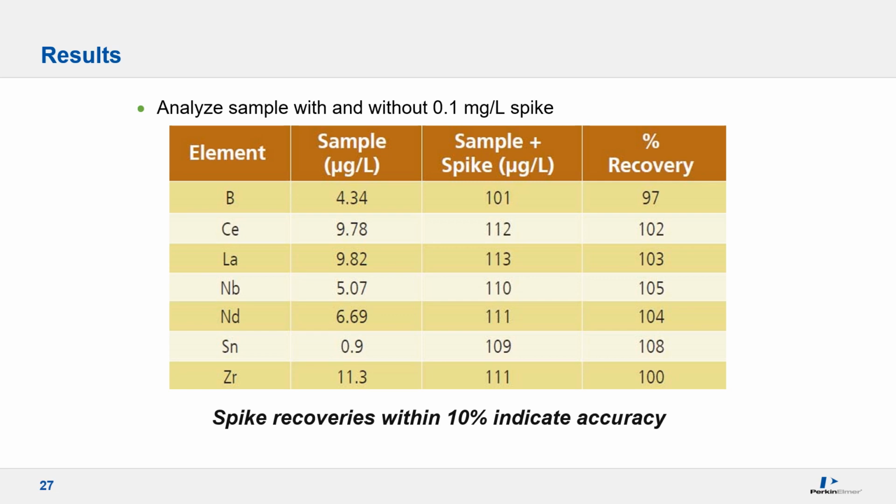The work demonstrated by this application has shown the ability of PerkinElmer's Avio 500 ICP-OES to resolve challenging interferences in a metallurgical sample using multi-component spectral fitting. Taking advantage of MSF allows samples to be analyzed in normal resolution mode, thereby not losing intensity at the expense of resolution. With metallurgical samples, there are a limited number of matrix components, but they are present at high levels, which lead to numerous spectral interferences. By applying MSF, most interferences can be resolved, making MSF a valuable tool for the analysis of impurities in metals and alloys.